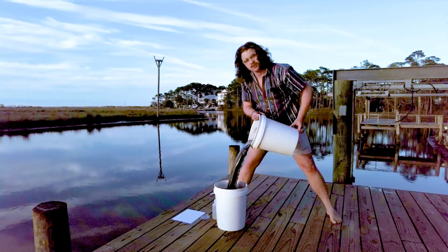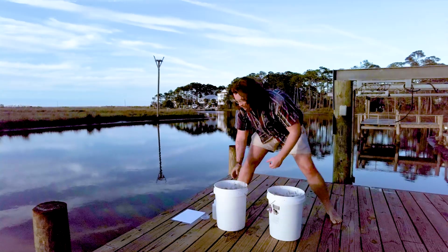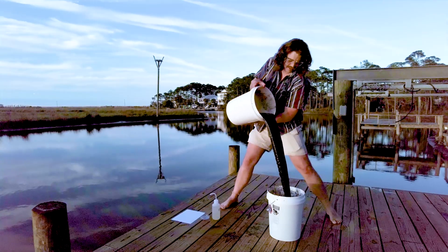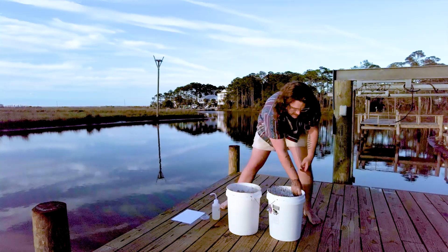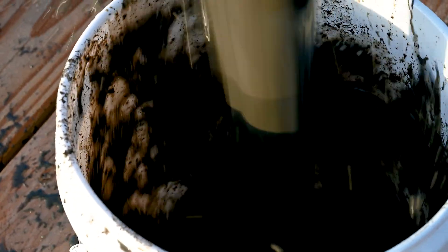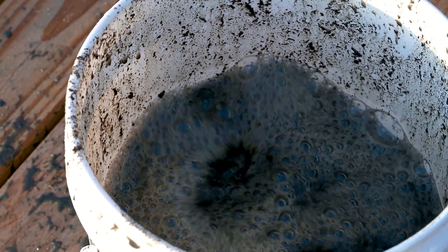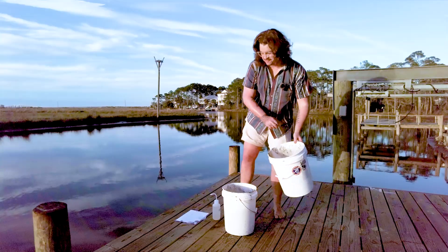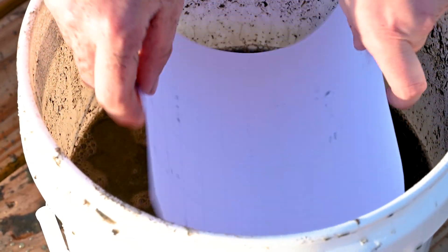What you're doing here is: one, shaking up the organisms that are within the top few layers of the sediment, and also creating a lot of bubbles. Because their cuticle is hydrophobic, they're going to stick to those bubbles. Then I'm going to take my piece of paper and quickly rest it on top of the bubbles on the surface of the water.